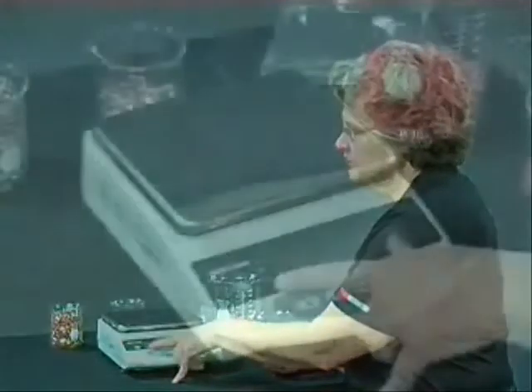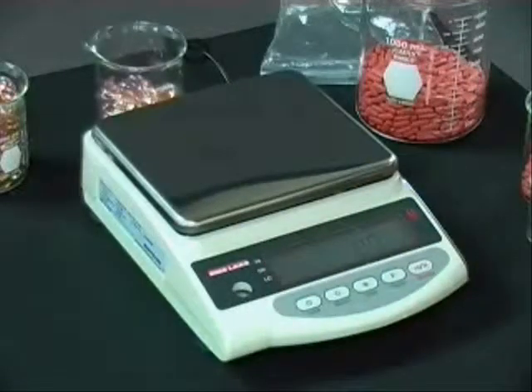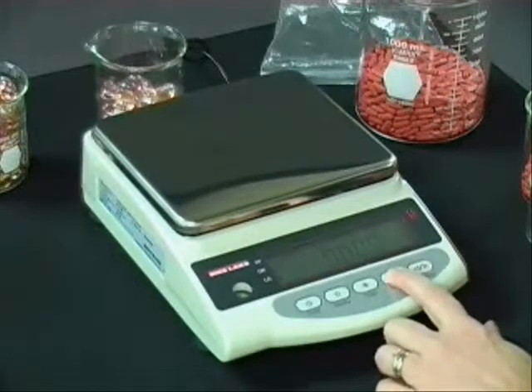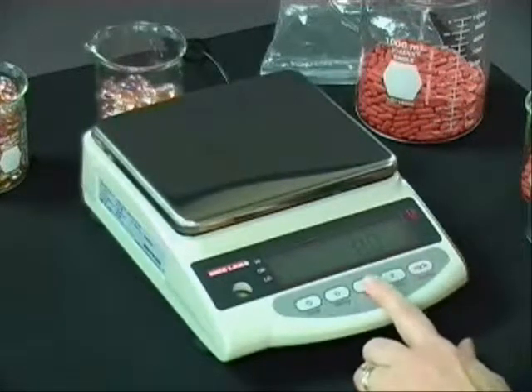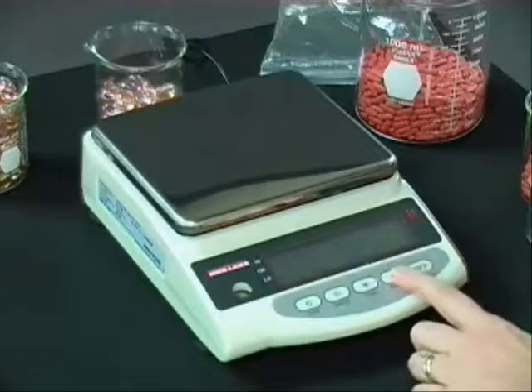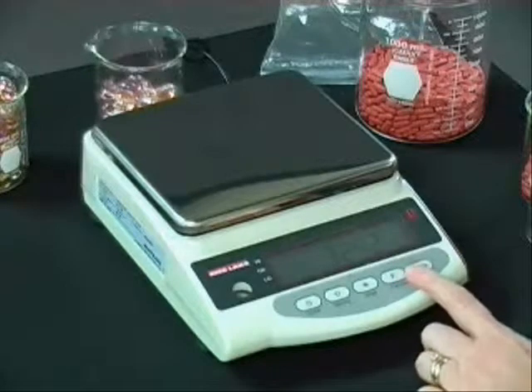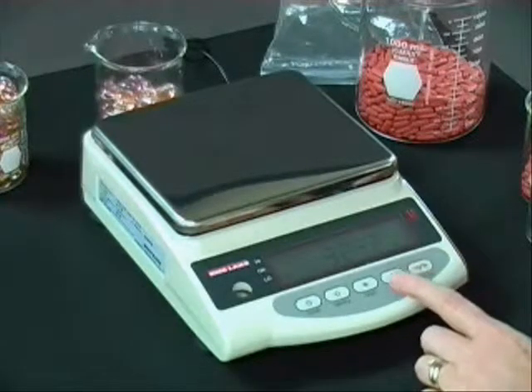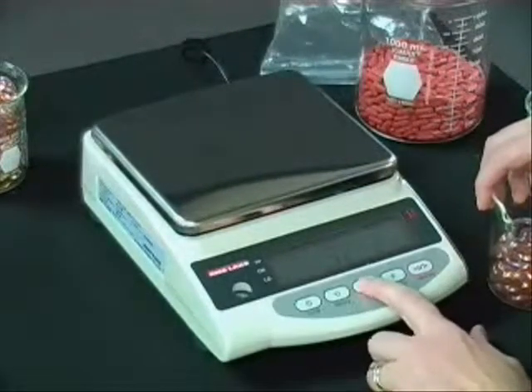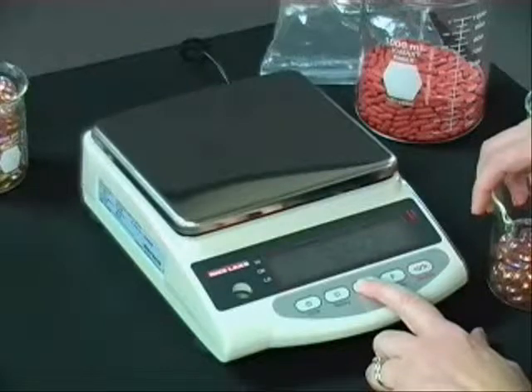Now, this is another function called the limit function. This functionality lets you use the low, okay, and high indicators. There are times when you want to check-weigh on your balance. I can press and hold the target key once I get back to my regular grams mode of weighing. It comes up to say I want to set my low value. I'll put my lower value on here — let me do that again. Press and set the low value.